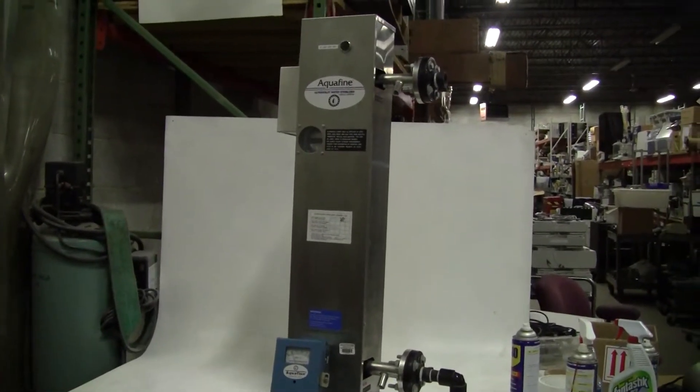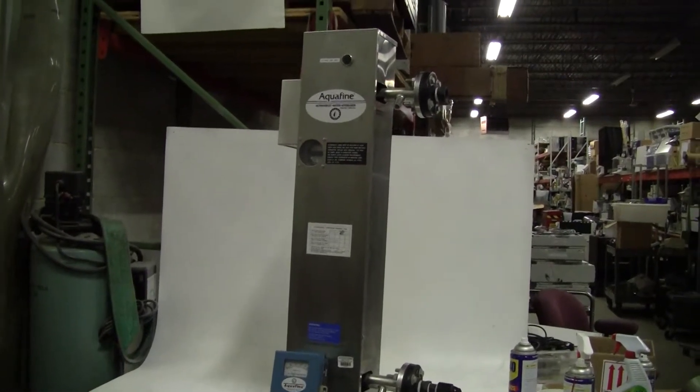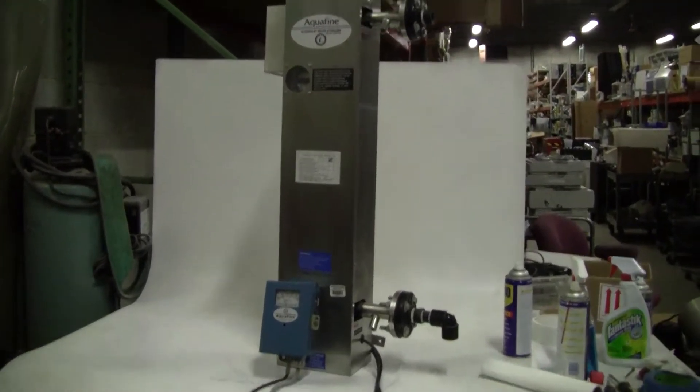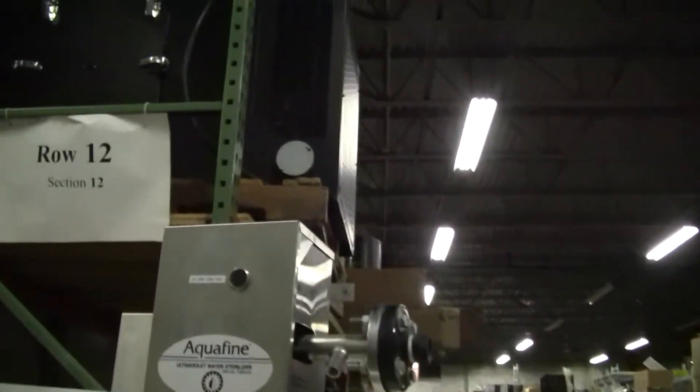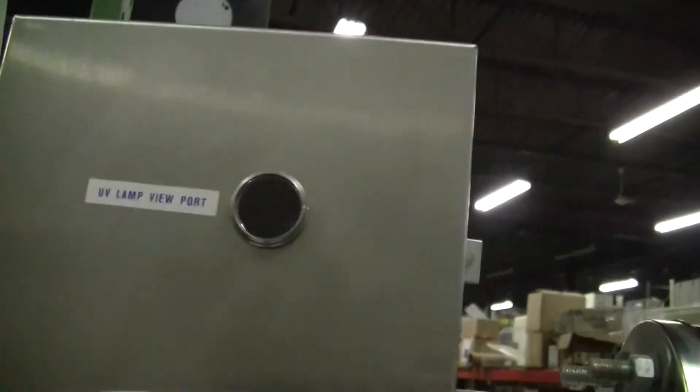Hi, this is Jim from Hitech Trader. Today we're looking at an Aquafine SL1 Ultraviolet Water Sterilizer. Look closer — you can see the UV light is on.